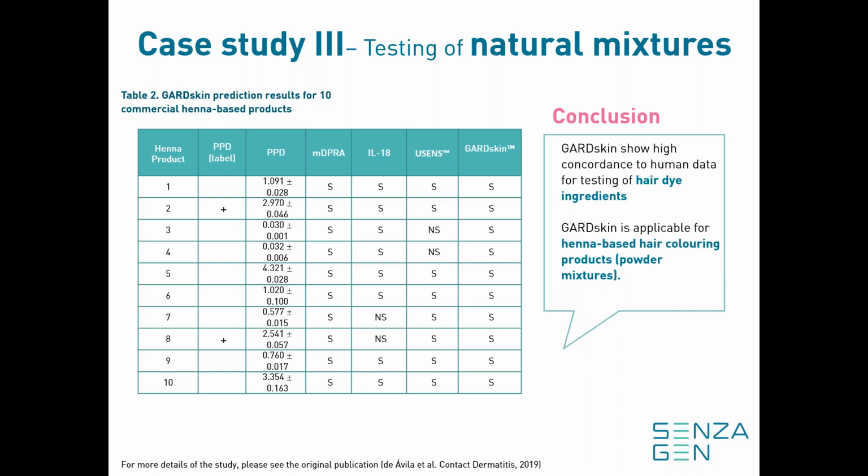And one thing that I think is quite interesting is that only 2 of the 10 compounds stated that they included PPD in their labels, but when our collaborators at the Goiás University actually performed HPLC on the samples, we could see that all of them actually contain PPD, but it was not labeled on the product. But it's really hard, of course, to tell if the sensitizing properties that were picked up in the in vitro assays are only based on the presence of PPD in this mixture, because it's a crude mixture, of course, and it could also be other types of effects.